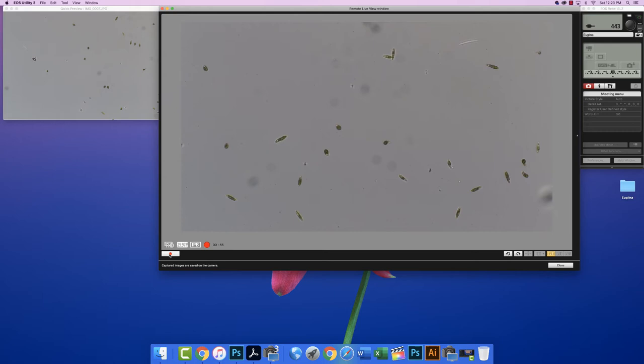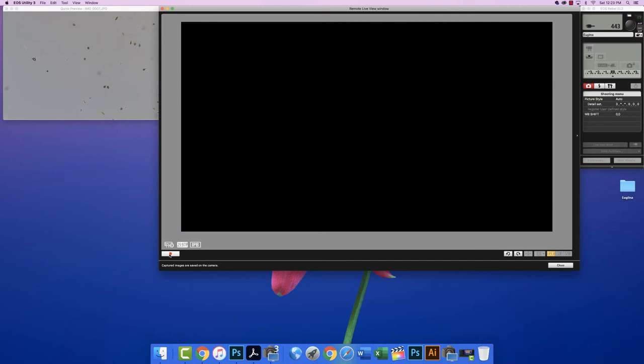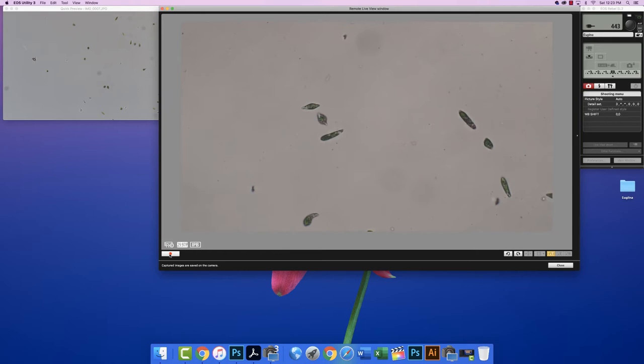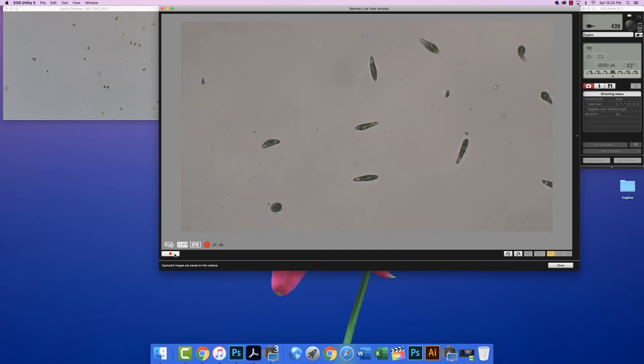Okay, so that was 1 minute of movie recording, so we'll stop there. Let's move up to the 20x objective and refocus. And we'll make a little movie at 20x. Okay, I'll stop the movie and I'll set it back to still images.